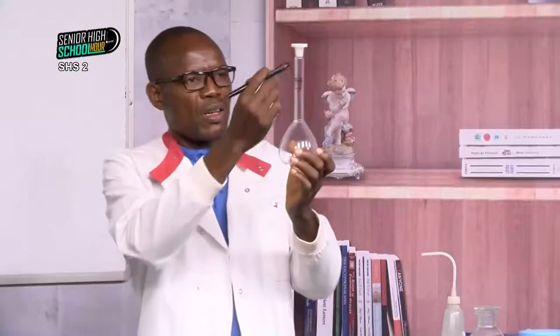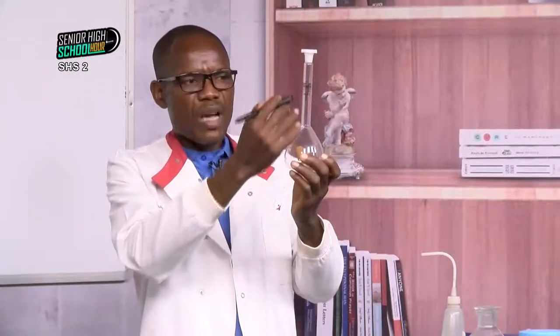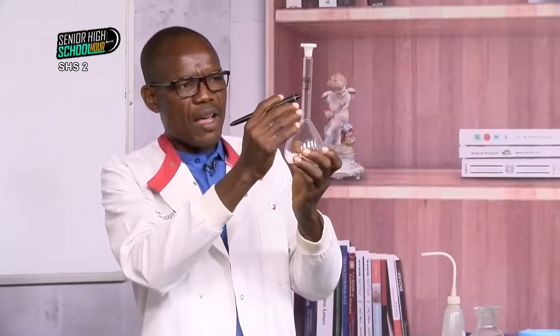What else? We are talking about preparing standard solutions, so I will need a volumetric flask. Oh, this is my very good friend, volumetric flask. This one, its capacity is 250 cm cubed. So it means that if I fill this standard volumetric flask with a solution to that mark there, then I have the volume to be 250 cm cubed.